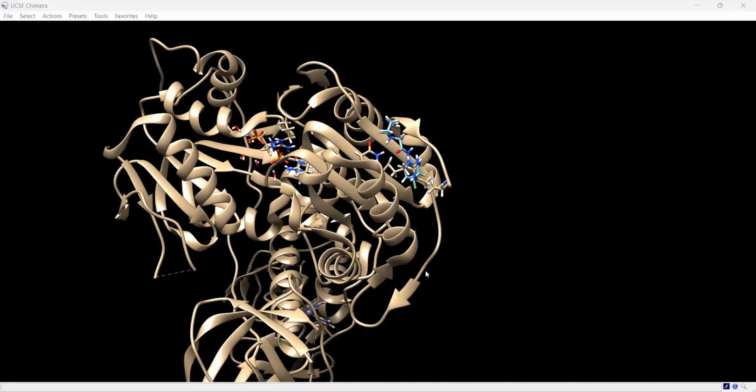I will do a separate video on the use of Marvin Sketch for calculating protonation states, because it is quite useful when you're unsure of whether your molecule is charged or not, or protonated or not. Okay, so charge +1, okay. And now it's running that charge calculation.